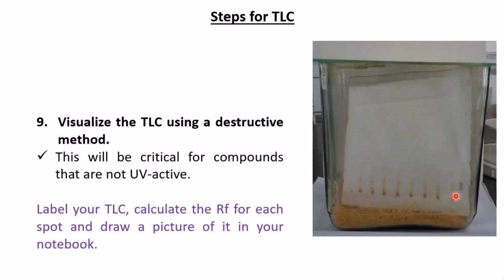So here, realize that this is an iodine chamber. This is used to visualize the spots. At the end of the day, the spots are destroyed, the plate is destroyed, and you can't do anything anymore with the plate. So another thing is the fact that if you want to use the destructive visualization technique, you have to make sure you've done your UV lamp visualization before bringing it here, because the moment you put it in the iodine chamber, everything is destroyed, right?